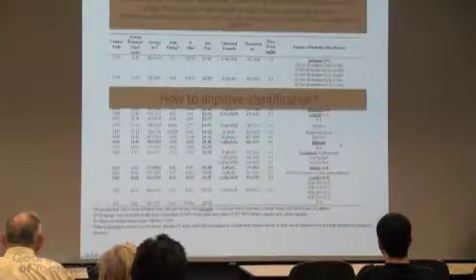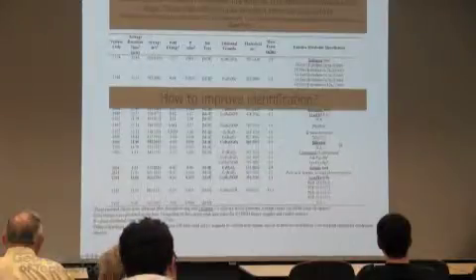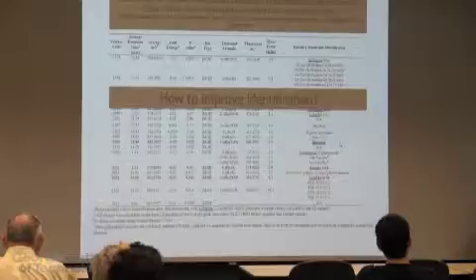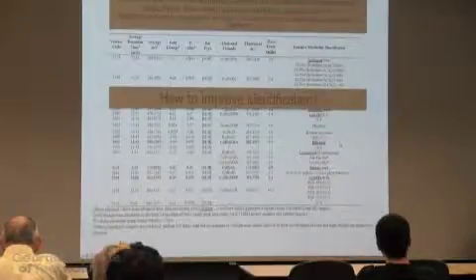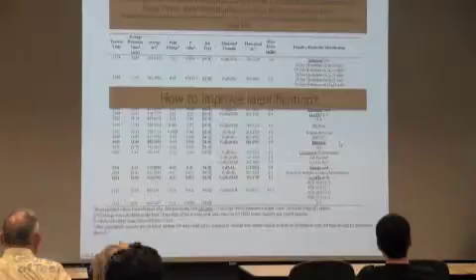And one of the things that we particularly are very interested in is how do you really improve this identification process? How do you really improve it? And that's important because any biological conclusion that comes after this is based on a careful ID. And you'll be surprised how many papers are out there where the IDs are treated very lightly. Okay, you shouldn't do that.